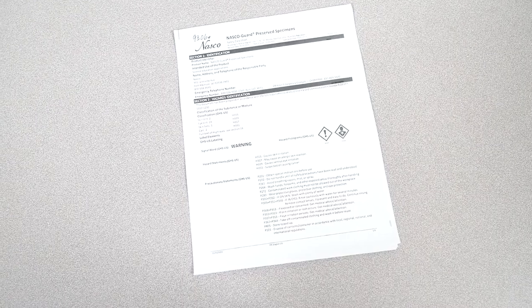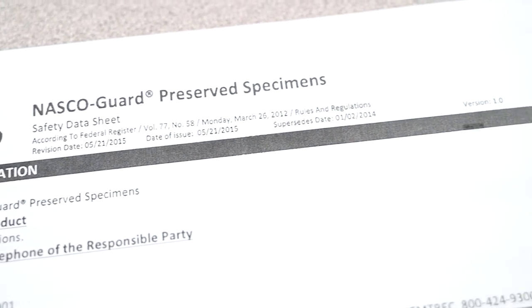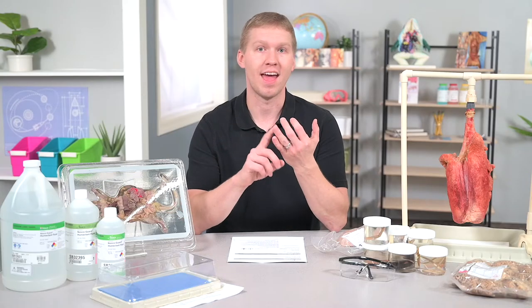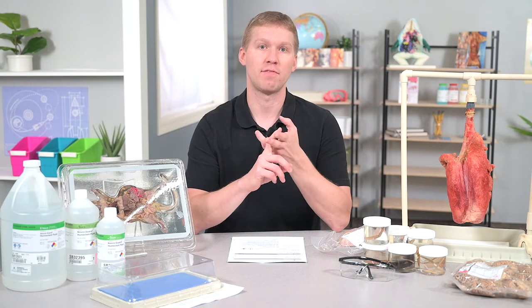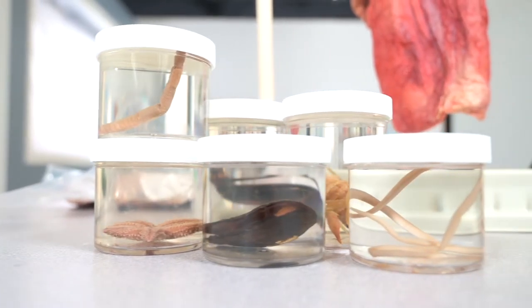As a customer, you have the right to know what is in both of these solutions. You can either view this information on our website or request a safety data sheet, also known as an SDS. It is required by law that our SDS includes information about the properties of each chemical, the physical, health, and environmental health hazards, protective measures, and safety precautions for handling, storing, and transporting the chemical. If you ever order preserved specimens, you should know what chemicals are being used. Not all companies are as transparent, so make sure to inquire.